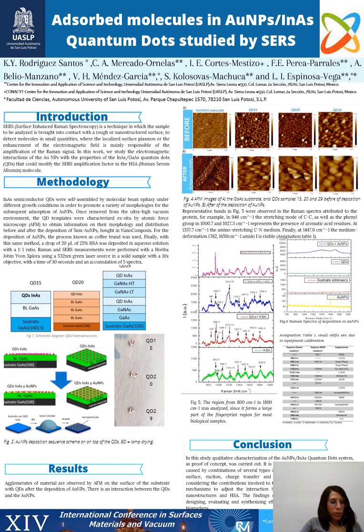In picture 5, the region from 800 to 1800 was analyzed since it forms a large part of the fingerprint region for most biological samples.